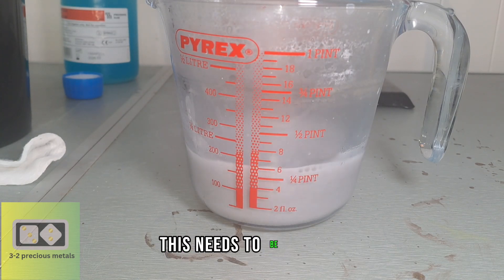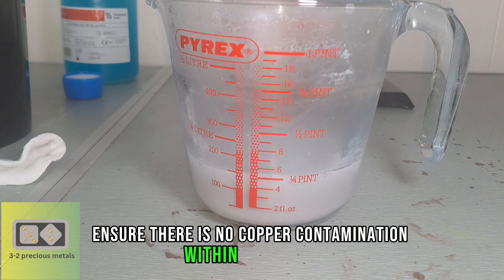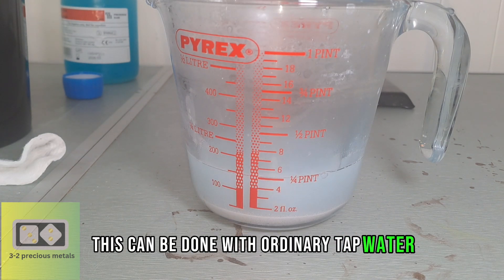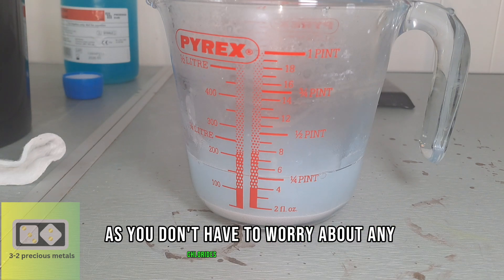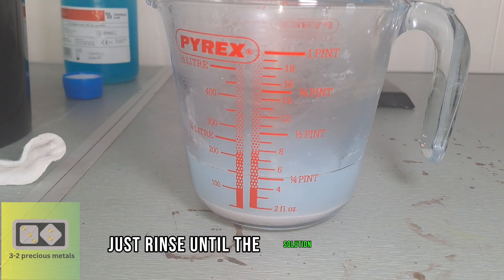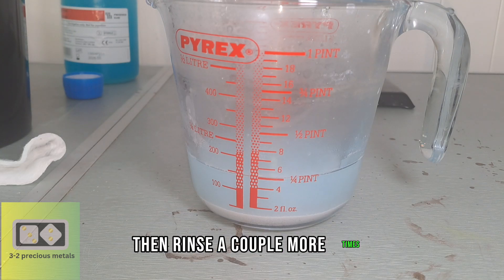This needs to be done to ensure there is no copper contamination within the silver. This can be done with ordinary tap water, as you don't have to worry about any chlorides in the water. Just rinse until the solution is clear, then rinse a couple more times.